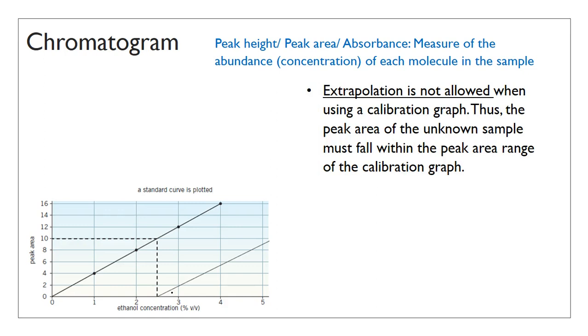I just have 2 things I want to point out, or maybe 3, when it comes to using a calibration graph. The first one is that you absolutely are not allowed to extrapolate when you have a calibration graph. I'm not going to generalize that you can never extrapolate. If you extrapolate, police won't be knocking on your door or anything, but it decreases the accuracy of the technique a lot if you have to do extrapolation.